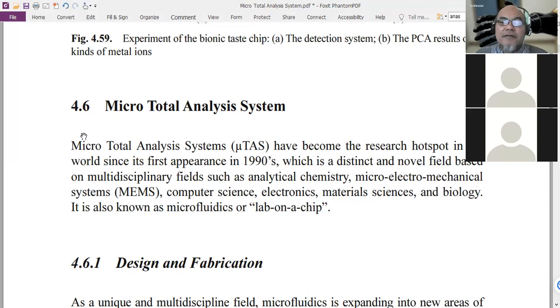You cannot use wax. Why? Because it melts. For PCR analysis, it doesn't fit because it melts. Even when the temperature is 60 degrees, or 40 degrees, it starts to melt already. So it's better you use a more heat-resistant hydrophobic barrier.